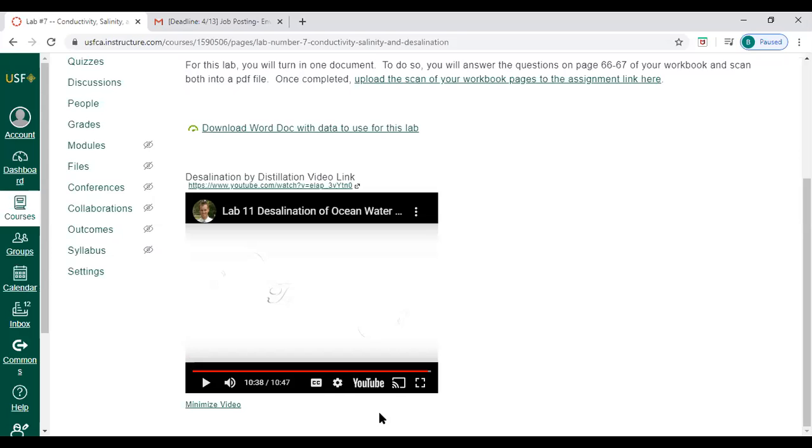So they measure conductivity. I'll briefly go over what conductivity is. You might have heard it if you've taken any sort of physics 2 or electrical circuits. Conductivity is just the ability to carry an electrical current. When it's relating to water, the more dissolved ions you have in a water sample, the higher your electrical conductivity will be, which means that the easier it will be to carry an electrical charge.